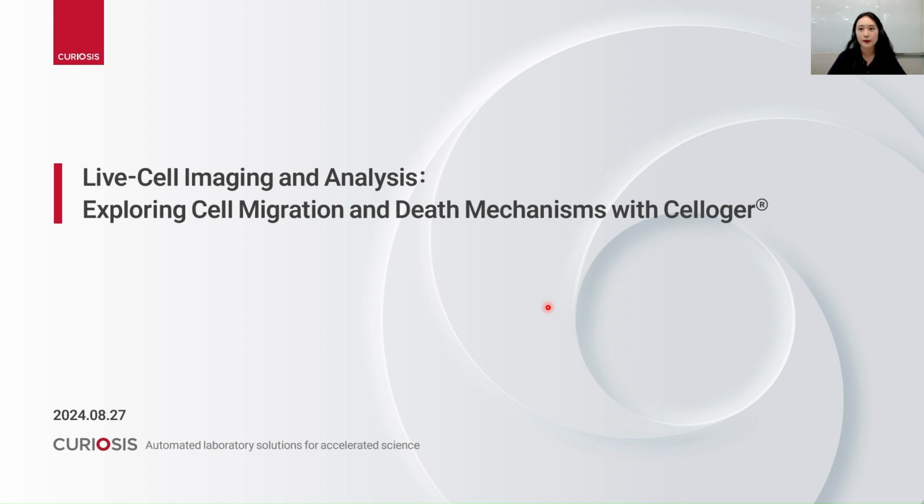I'm Eunyoung Lee and I'm delighted to have you with us as we explore live cell imaging and analysis, uncovering cell migration and death mechanisms with Celloger. Thank you for taking the time to join us.